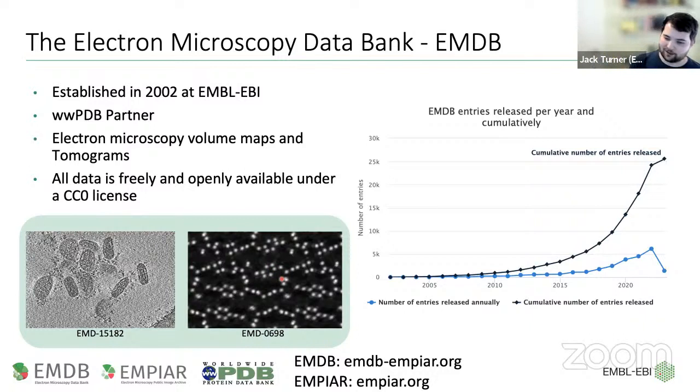The reason I wanted to put these two up is just to show the scales that we really actually archive across. So we have really all the way from atoms here to viruses. And when I show you a bit about what we have in EMPIAR, you'll see that we archive all the way up to organisms, which of course is something really only electron microscopy can do, to be able to collect over all of these scales, which makes it a very exciting technology.